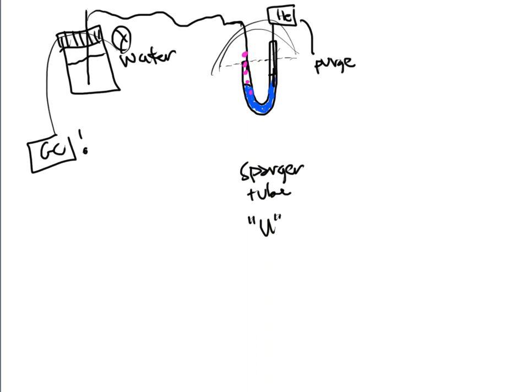All right, so for instance, when I say that, let's say that we do not have a purge system and we have some sample. We know that some of that sample will go up here in the headspace. But if I don't do anything to it, it's going to get to a certain point where it comes to equilibrium. That means that no more will go into the headspace. If I have a really weak solution, then no more will go into the headspace, and I have a really weak concentration in the headspace. Well, if I could somehow suck it up off the top and get rid of it, in the next step, I could get more of this solvent because it's no longer at equilibrium now, right? I could get more of this chemical to evaporate and go into the headspace.